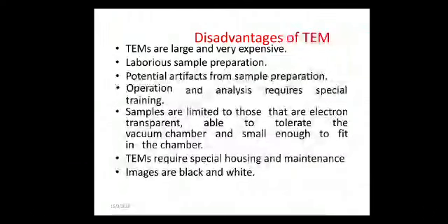Then the sample size should be less than or equal to 50 nanometers. Detail down to 1 nanometer size can be analyzed, and sometimes analyzed in TEM.